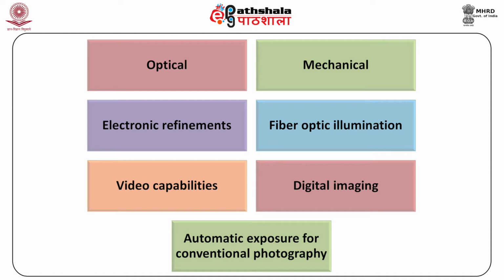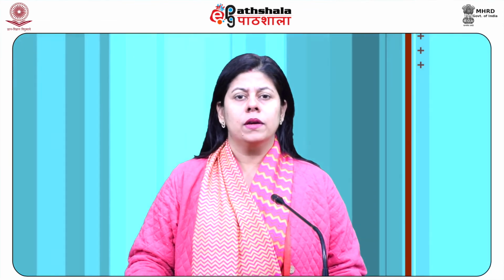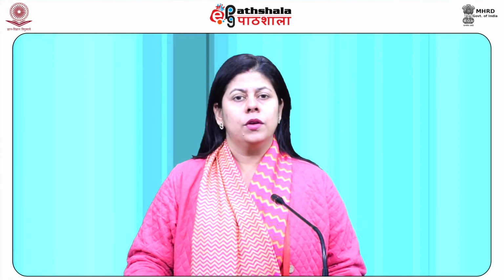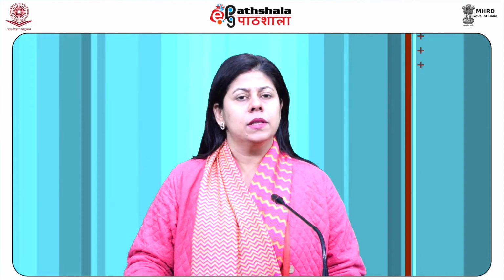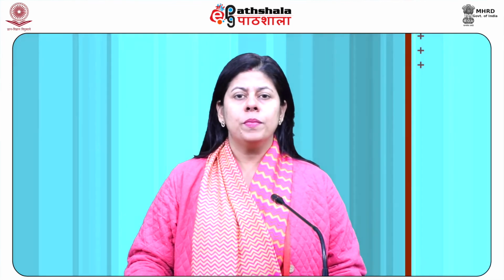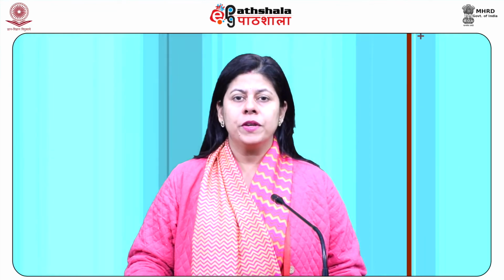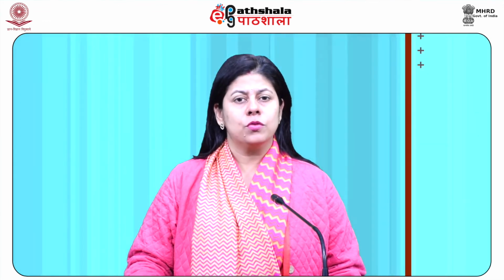for conventional photography. Petrographic microscope. A petrographic microscope is a type of optical microscope used in petrology and optical mineralogy to identify rocks and minerals in thin sections. The microscope is used in optical mineralogy and petrography, a branch of petrology which focuses on detailed description of rocks. The method is called polarized light microscopy.